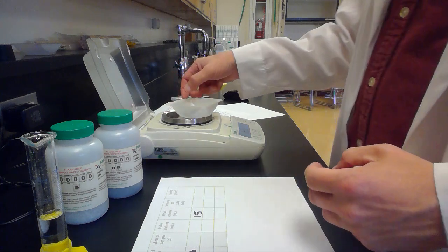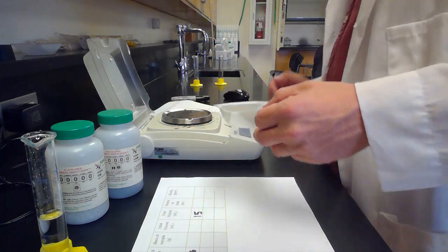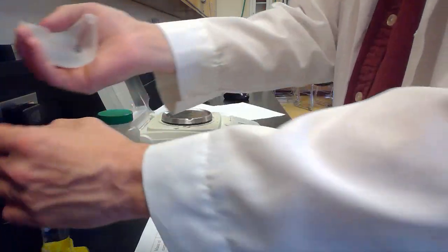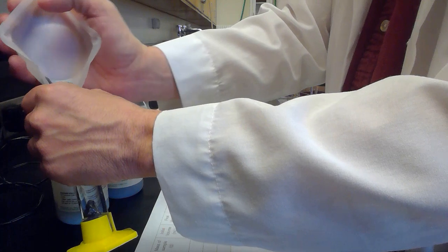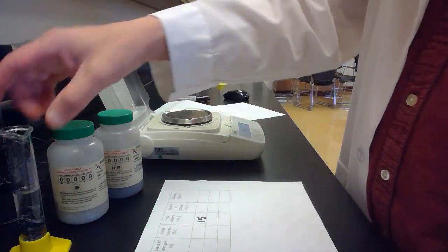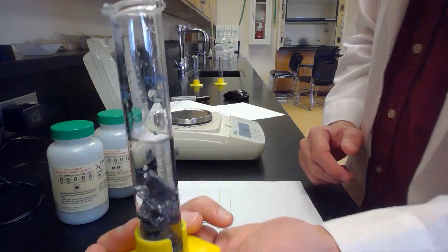And then what we're going to do, what is it, step number 4, I think? Add the silicon chunks to the graduated cylinder. Add slowly so we don't splash. So I'm going to dump my silicon in there. And now you'll notice the water level is higher.